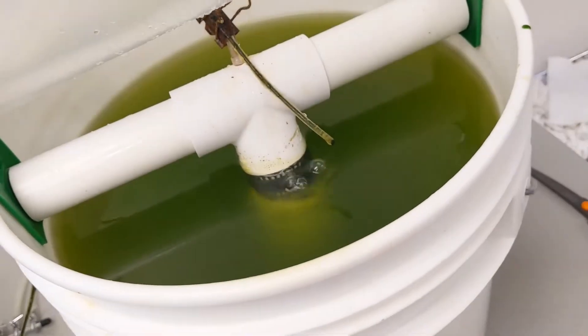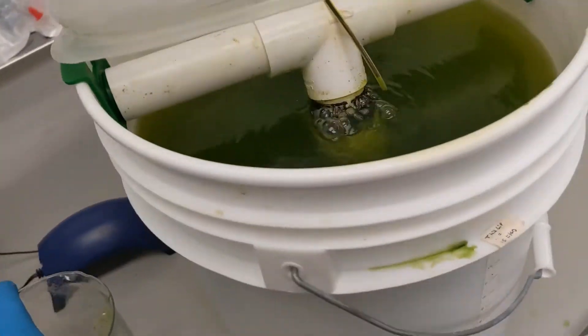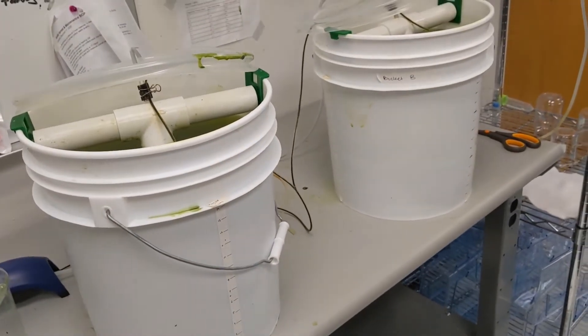These rotifers are harvested every day and are a staple for the diets of young zebrafish. We also feed them to adult zebrafish to improve their breeding and to give them a little treat.